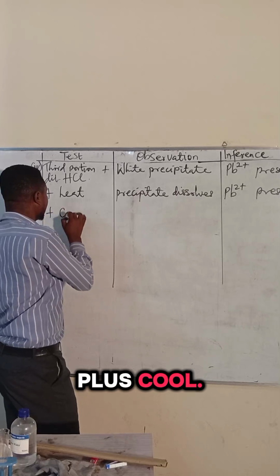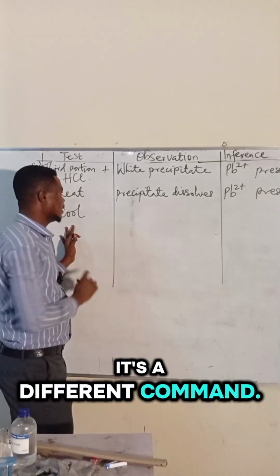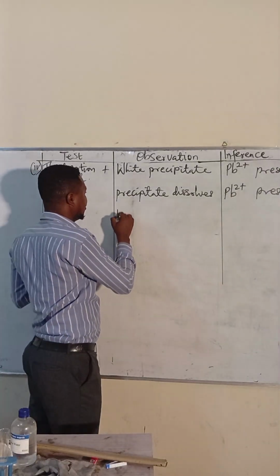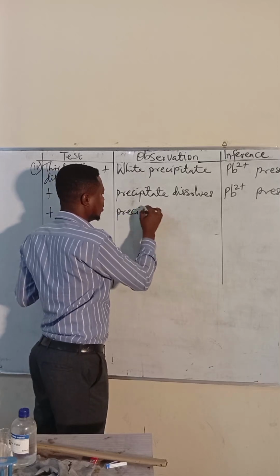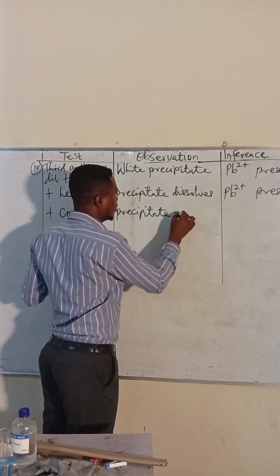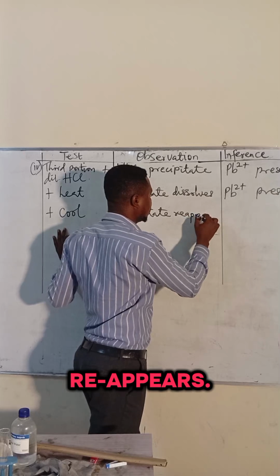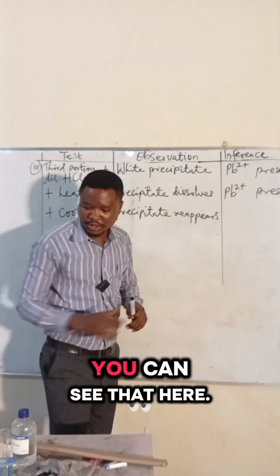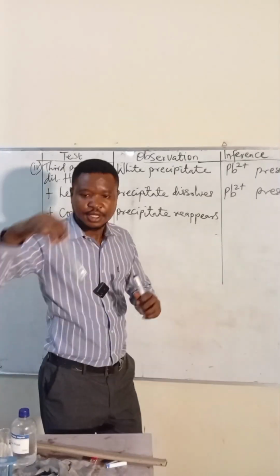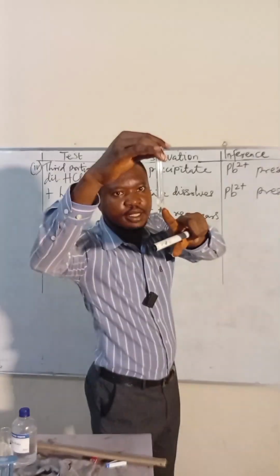Plus cool. A different line because it's a different command. Precipitate reappears. You can see that here. The precipitate reappears on cooling.